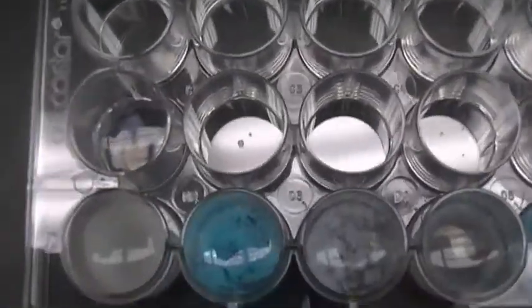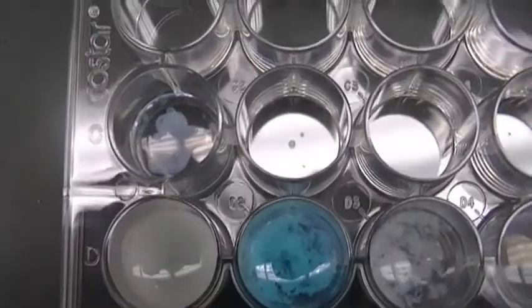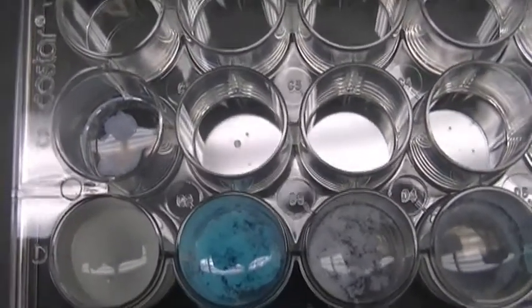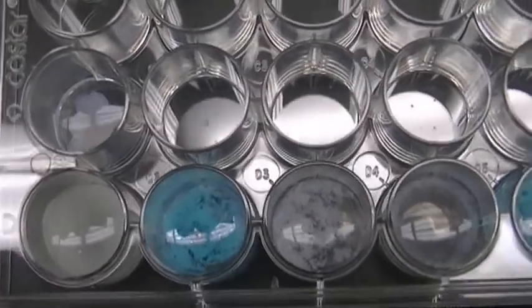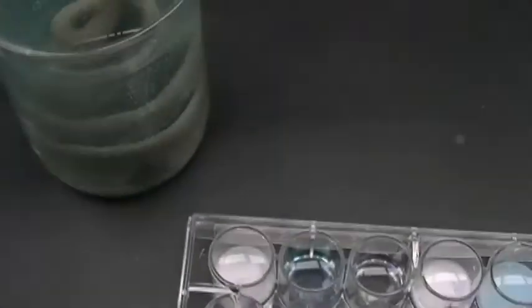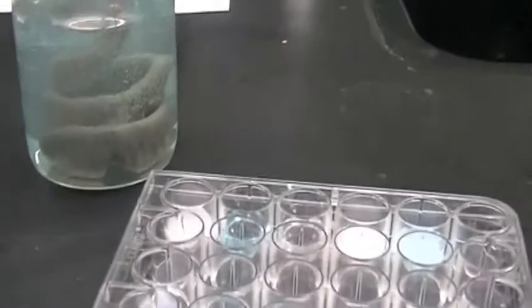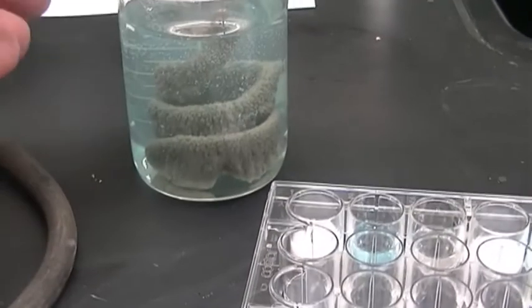All right, and so there is a small amount of precipitate being formed, which indicates that not all of our silver has been precipitated onto our copper coil. And the reaction is probably going slower because it is coated with the silver. So I will knock the silver.